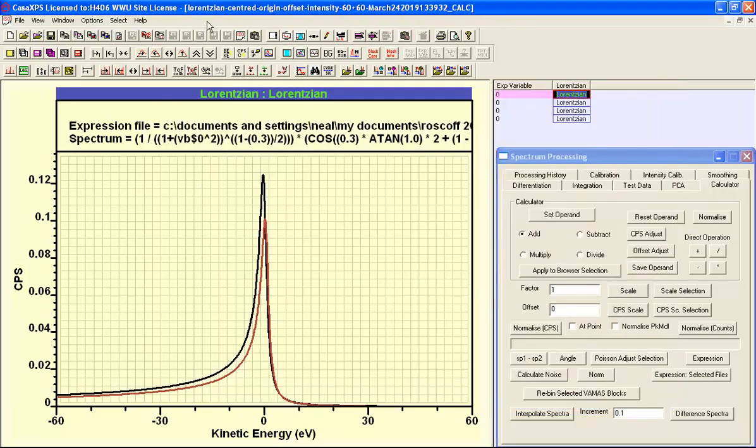However, when you see the line shape, its position is different from the position that was defined by that closed form, and that's because the DS line shape is ensuring that when you have a Lorentzian based on the DS line shape, the full width half maximum for that Lorentzian will be unity, whereas in the case of the expression that's not true. So we need to then fit these data, and once you've pressed Ctrl G to fit the data, you can see that the fit is equally as good. It just means that the parameters have slightly different meanings depending on the line shape and how it's defined.